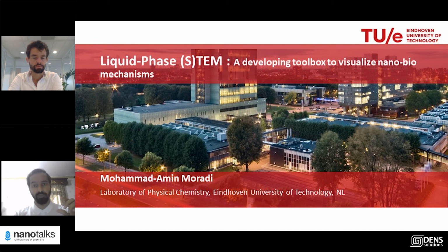It's better to do that with the beam, but you can use a polymer which is sensitive to heat and temperature, and then play a little bit with your liquid, because the smaller the liquid pocket you have, the more chance that your particles get stuck to the corners of the graphene interfaces. So this is all possibility, but also more to optimize for any kind of system depending on your size, your material, and the interaction with the graphene layer.